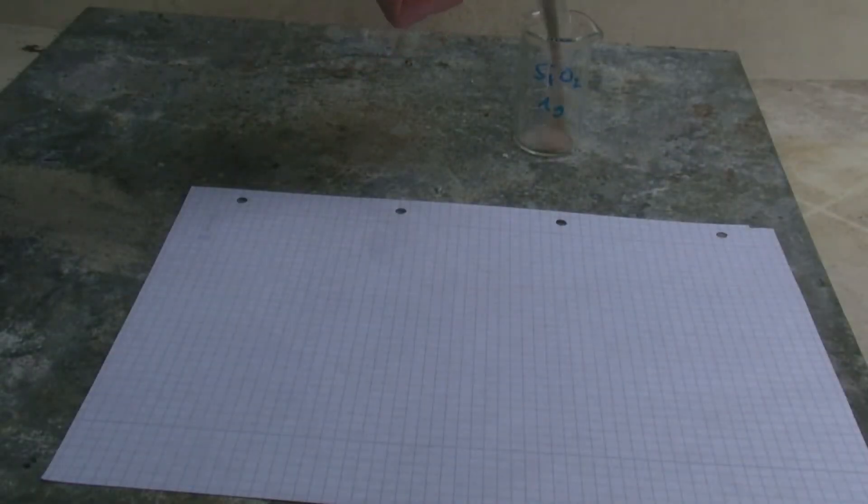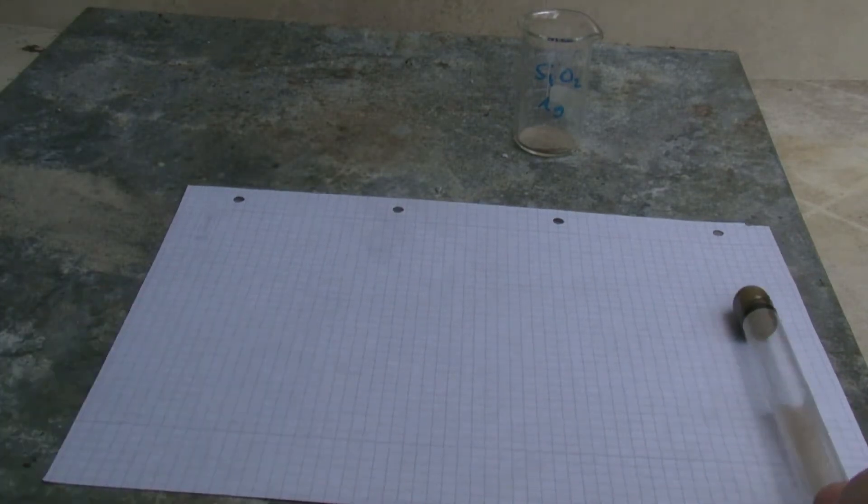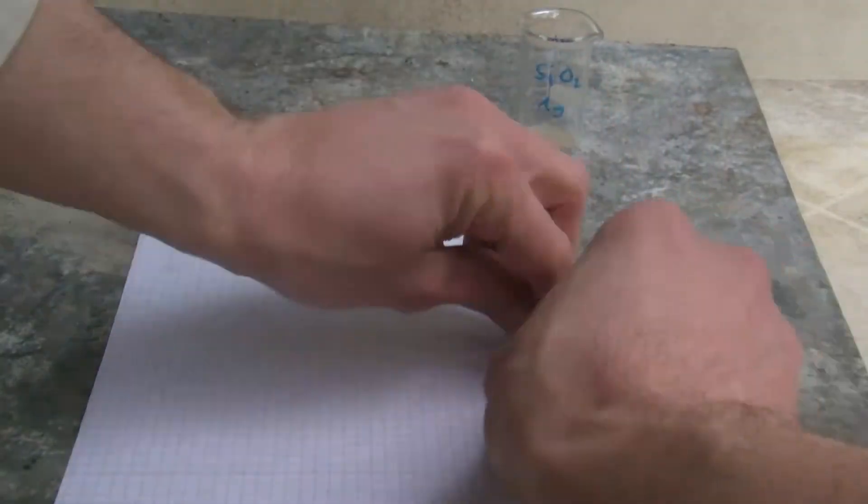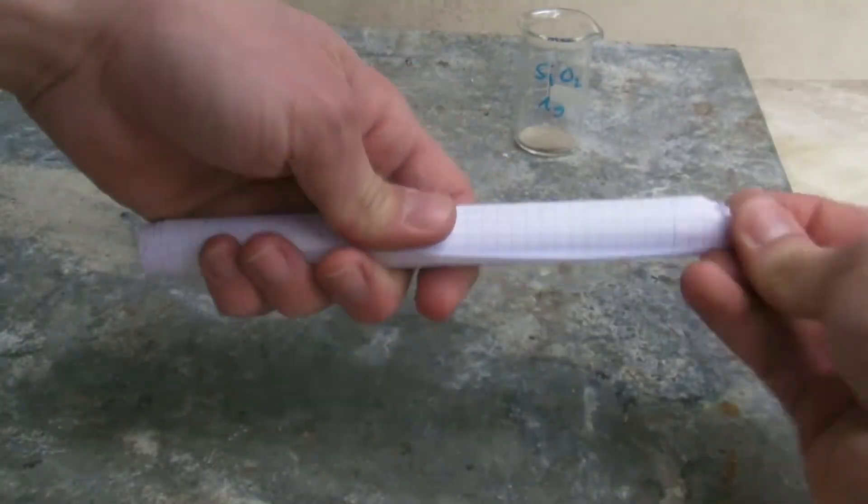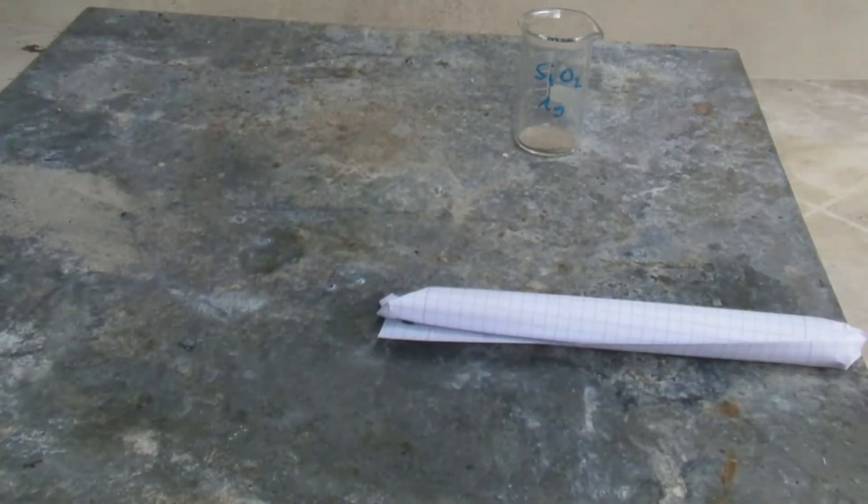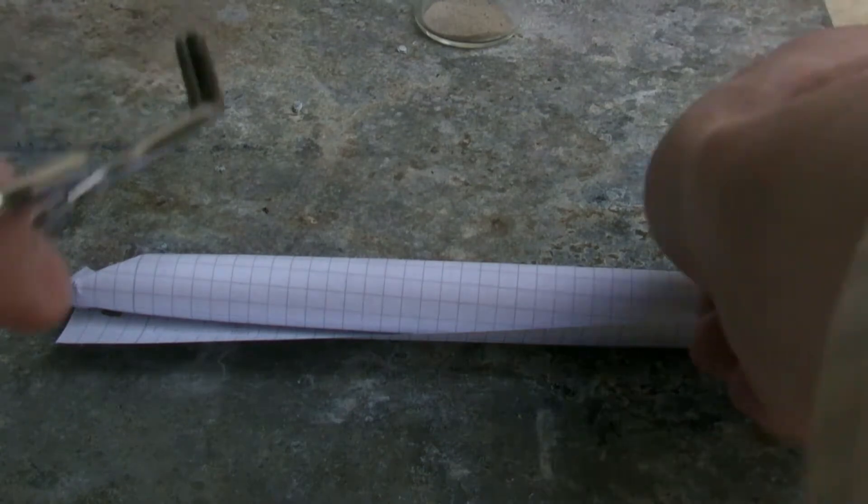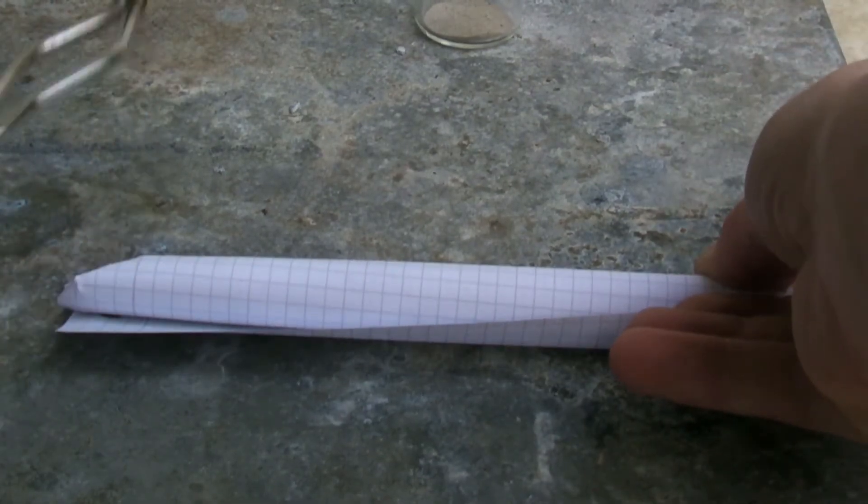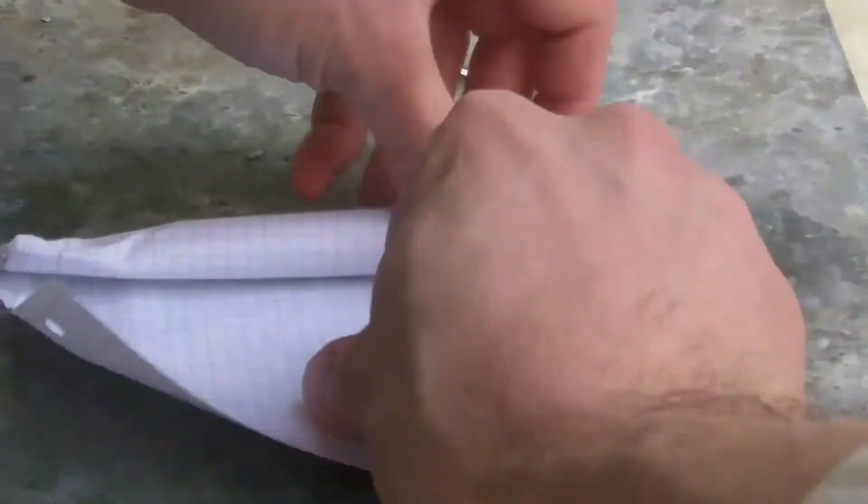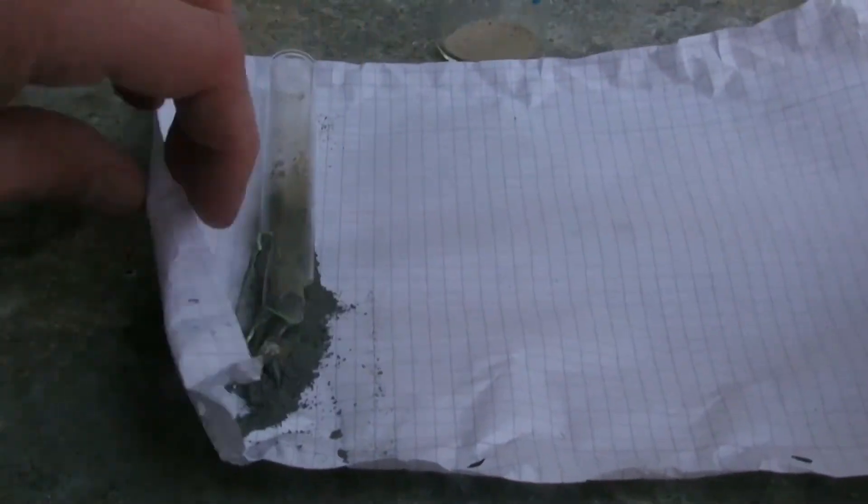Next the excess sand is dumped out and the test tube is wrapped in a sheet of paper so that the ends can be folded. Now the tube is broken at the end with a product. After that the paper just has to be unrolled and the shards can be removed manually.